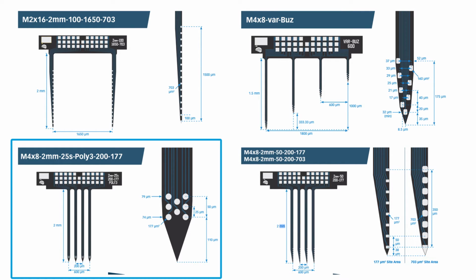This is a polytrode configuration. This is a really powerful technique for pulling signals out of the noise, or if you need to do spatial localization, you want to know where your neurons are or how they're connected to each other. So these closely spaced arrays, you can sample multiple neurons, or you can sample a neuron across multiple channels.